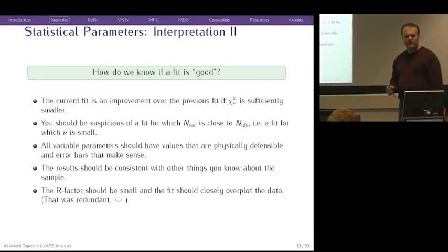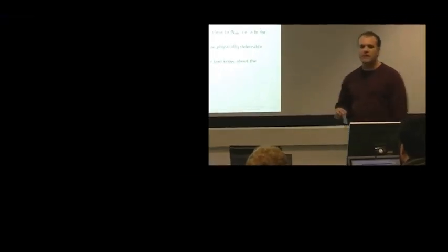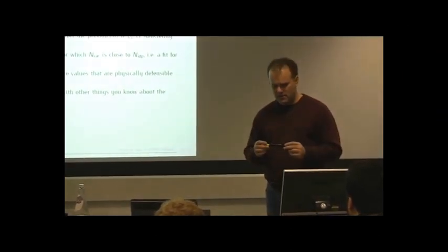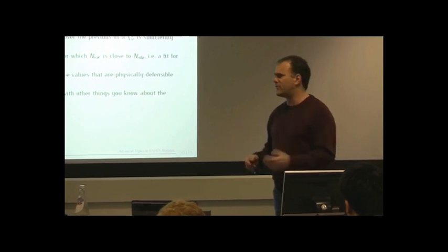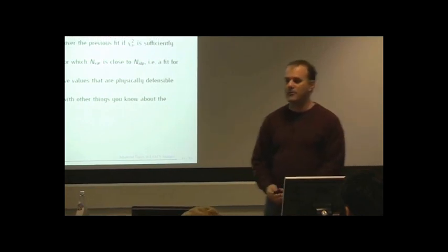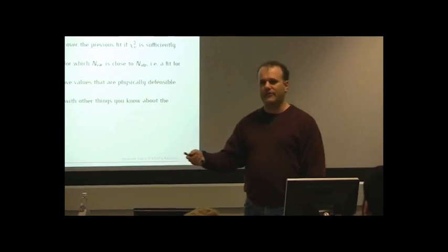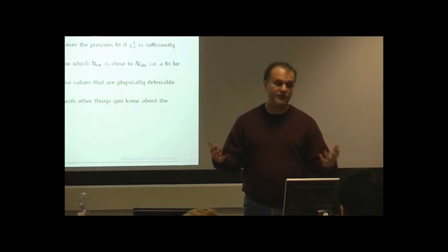The results should be consistent with other things you know about the sample. If you've done, say, a UV-vis experiment to determine something about what kinds of ligands you have in the material, or if you've done some diffraction on a crystal and you know something about the structure of the crystal, and then you do an XAFS experiment and the story is wildly different from other things you know about the material, you either need to reconsider the XAFS analysis, or you need to come up with a way to explain why the XAFS measurement would be wildly different from the other things you've measured on the material.